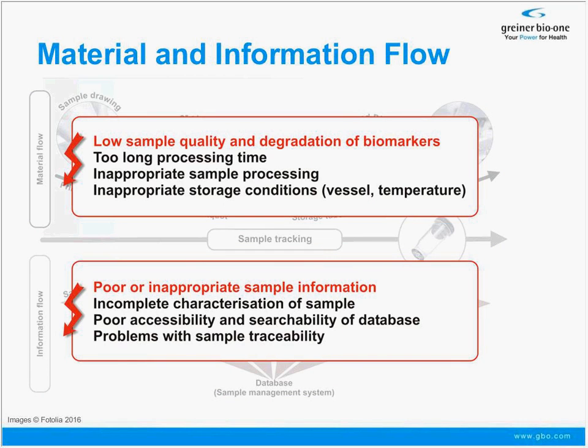What can happen basically is that you have maybe a too long or inappropriate sample processing, or your choice of your storage vessel or storage temperature is not really what it's supposed to be. All this can lead to low sample quality and finally degradation, alteration of your biomarkers in your biospecimen. What can happen is that there is an incomplete characterization of your sample at the very beginning. Later on, you will never ever fill in this gap.